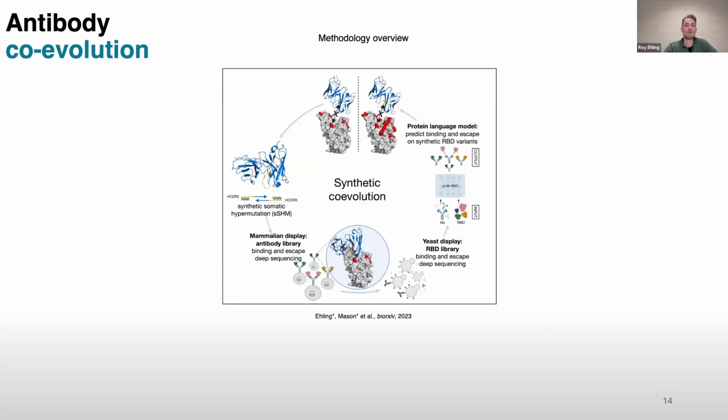So the workflow was as follows. As I just mentioned, we first generated the antibody libraries, then sorted these into distinct pools. So imagine you have a library that displays an antibody. You sort these first into alpha, beta, and delta. These would form then distinct neopools.